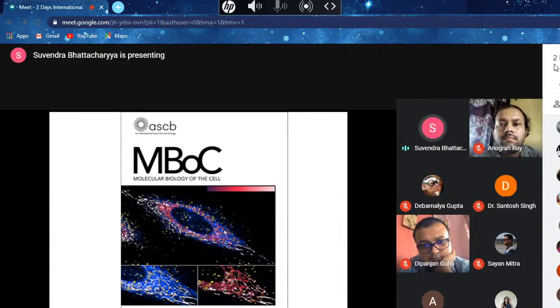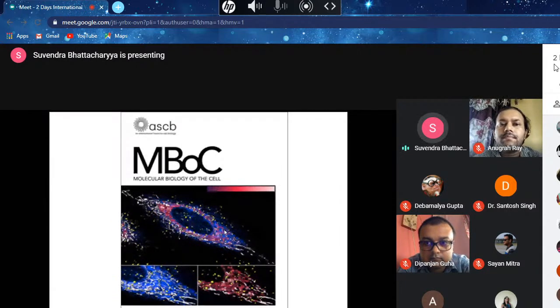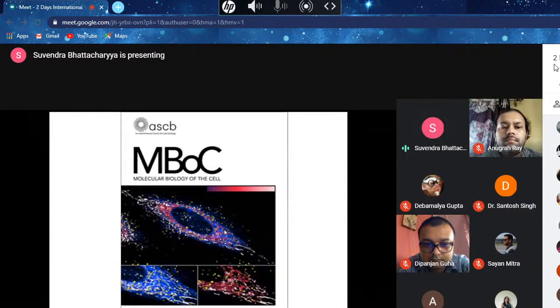Obviously, nowadays it is more interesting to use some of the super resolution microscopes that are already available in our institute, and we are also trying to procure another one with structured illumination techniques to allow us to go into more detail about these interactions that we are talking about, these endosome-mitochondria interactions or mitochondria-ER interactions, and about the finer details of the structures and the alterations that we are observing and their connection to the microRNA functions. So that's the thing we are following.